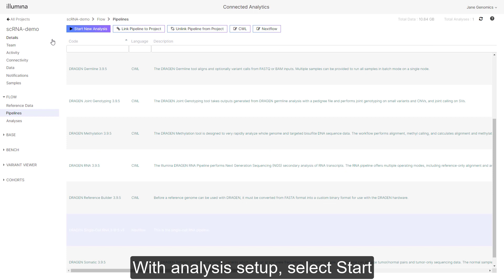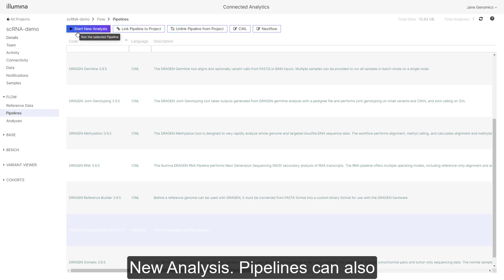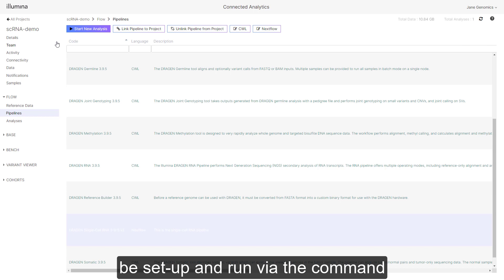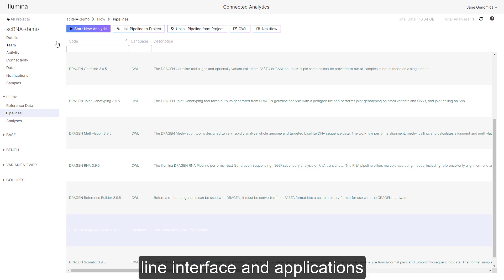With analysis set up, select start new analysis. Pipelines can also be set up and run via the command line interface and applications program interface if desired.